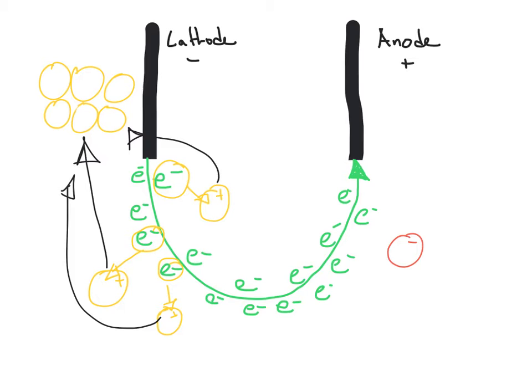Because of that strong positive charge, the chlorine, which had a negative charge, meaning it had an abundance of electrons, actually lost one of its electrons that entered that flow of electrons moving throughout our circuit. And when two chlorines that were near each other each lost an electron, they came together to form chlorine gas, which is what we saw exiting as a bubble.